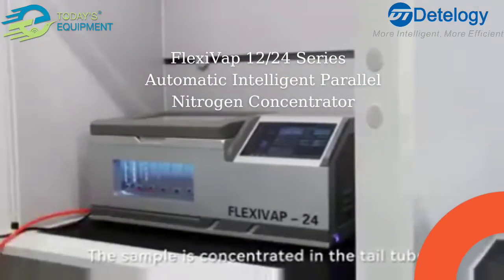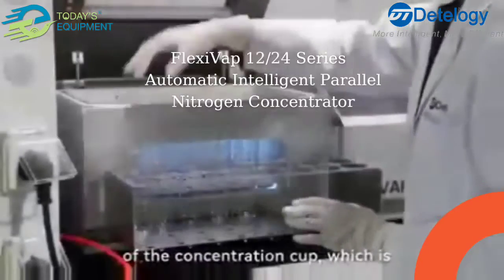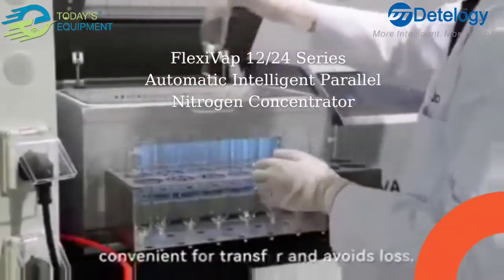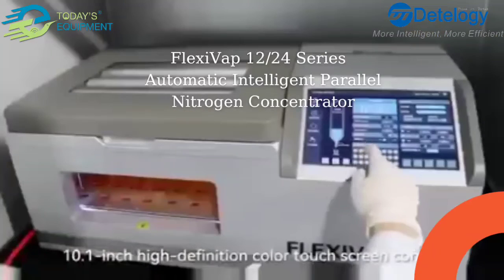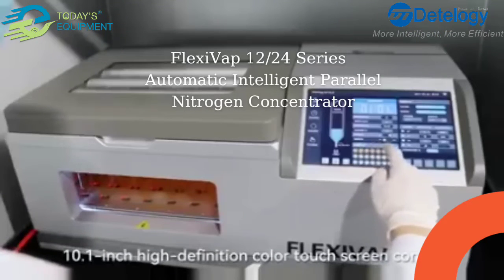The sample is concentrated in the tail tube of the concentration cup, which is convenient for transfer and avoids loss. A 10.1-inch high definition color touch screen provides control of the device.